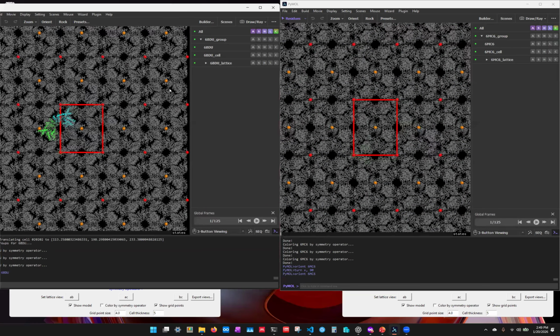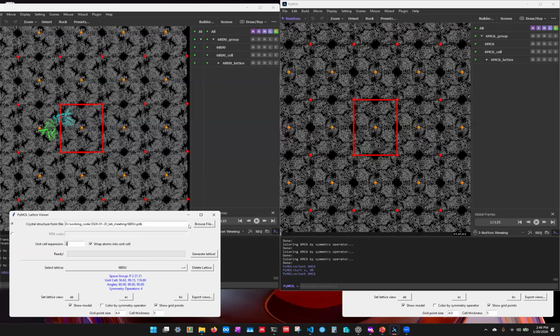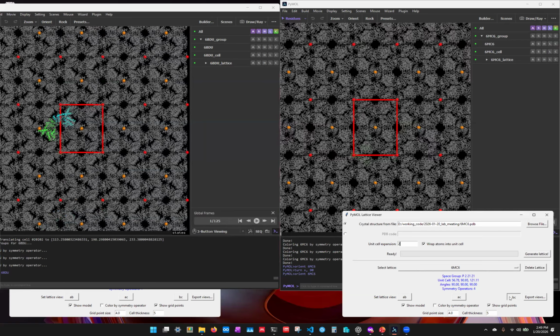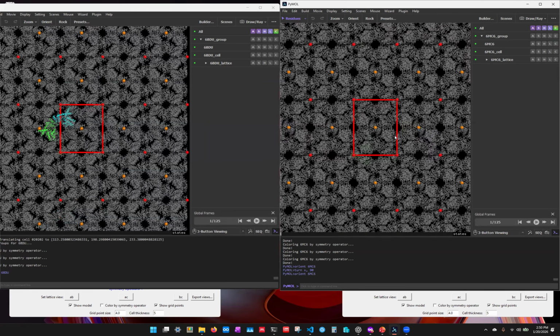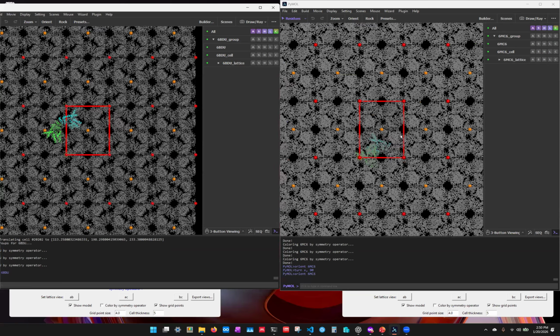I don't know what I'm supposed to be looking for. Sorry, I know this is tricky, but if you just focus on the empty space that isn't occupied by atoms, you can see there are these rings that are packed in together. So in theory, you could superimpose those on one another, and they would not just look like the same structure in the asymmetric unit. In fact, it's the entire physical crystal that looks the same. So the packing that generates the physical crystal is the same.